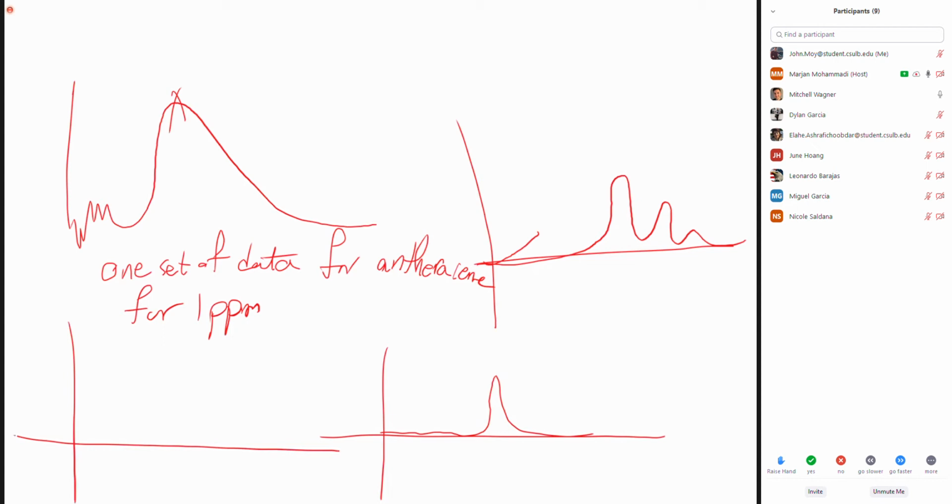I mean the absorption. All of those, I'm looking at exactly one right now, all that anthracene data. So you are going to show me, okay, this is the absorption. Then the excitation, it's happening a little bit here, and then the fluorescence is going to be right here. It's good for you too. You are going to see how this process is happening.